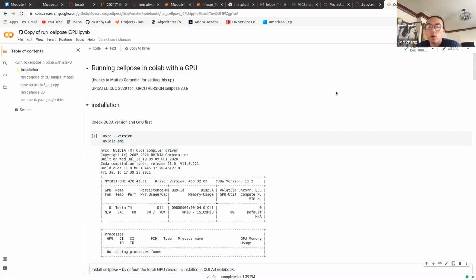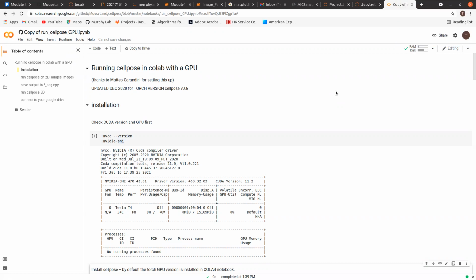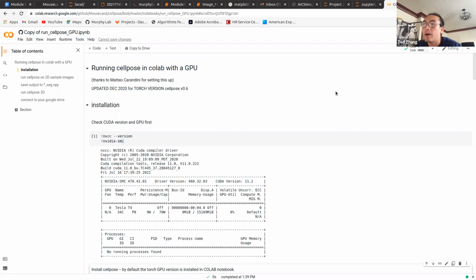Okay, I see. So you already have a segmented mask. You also have the corresponding image as well? Yes. And it's in a .mat file. I'm not sure about the format exactly. That's interesting because ideally for your mask, the output of CellPose is going to be an indexed image, in the sense that it gives you the same resolution.